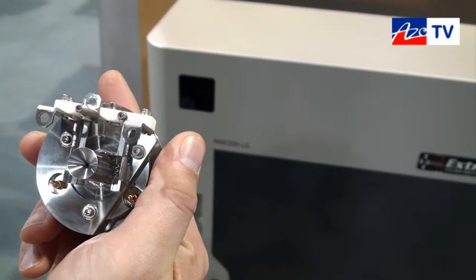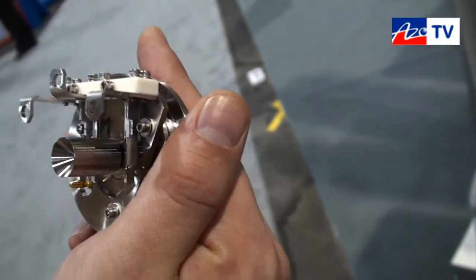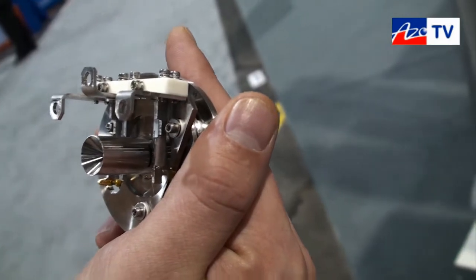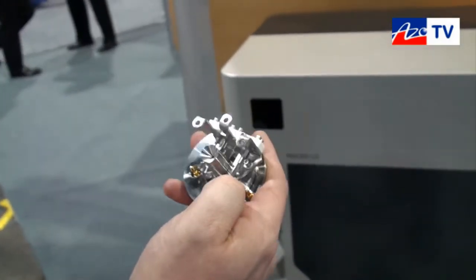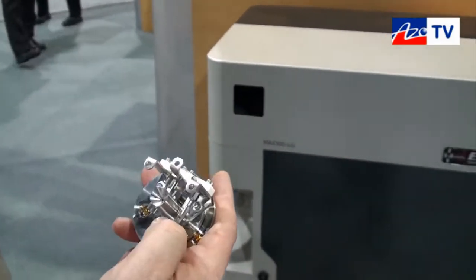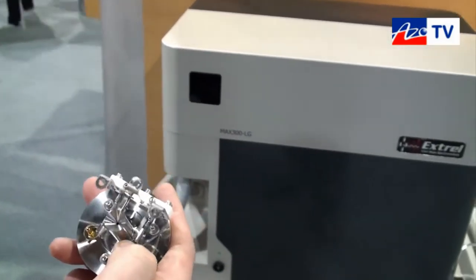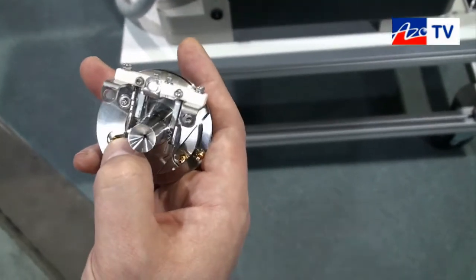Another feature of our Max 300 industrial systems is the dual filament assembly. We always have one active filament and one spare filament. The active filament is always running and the spare filament holds in the background, automatically switching over when the active filament fails.